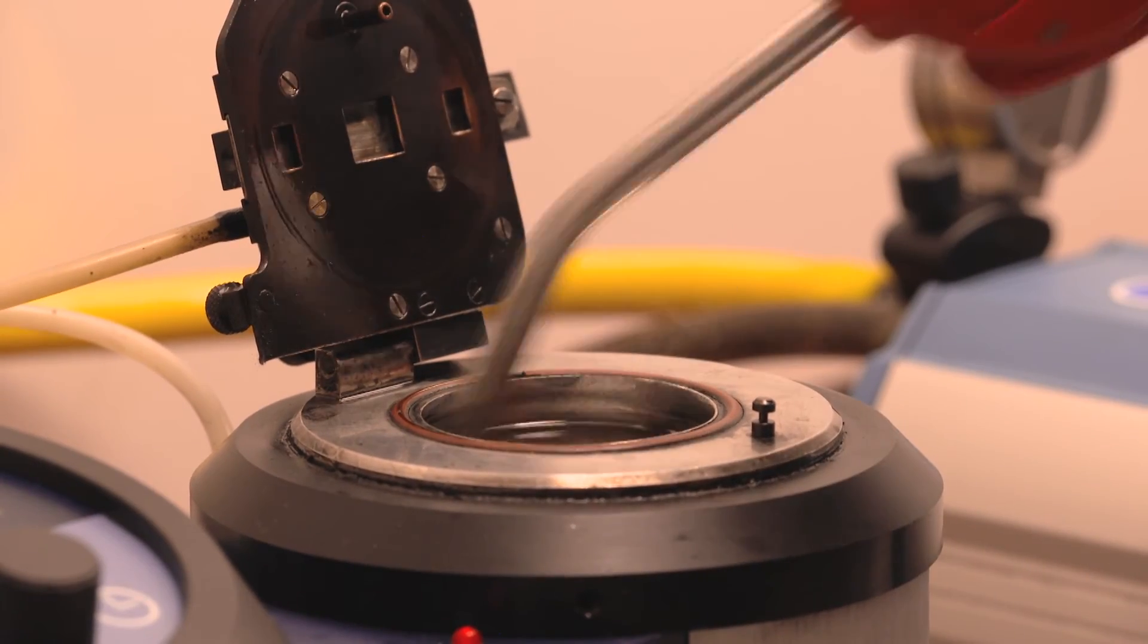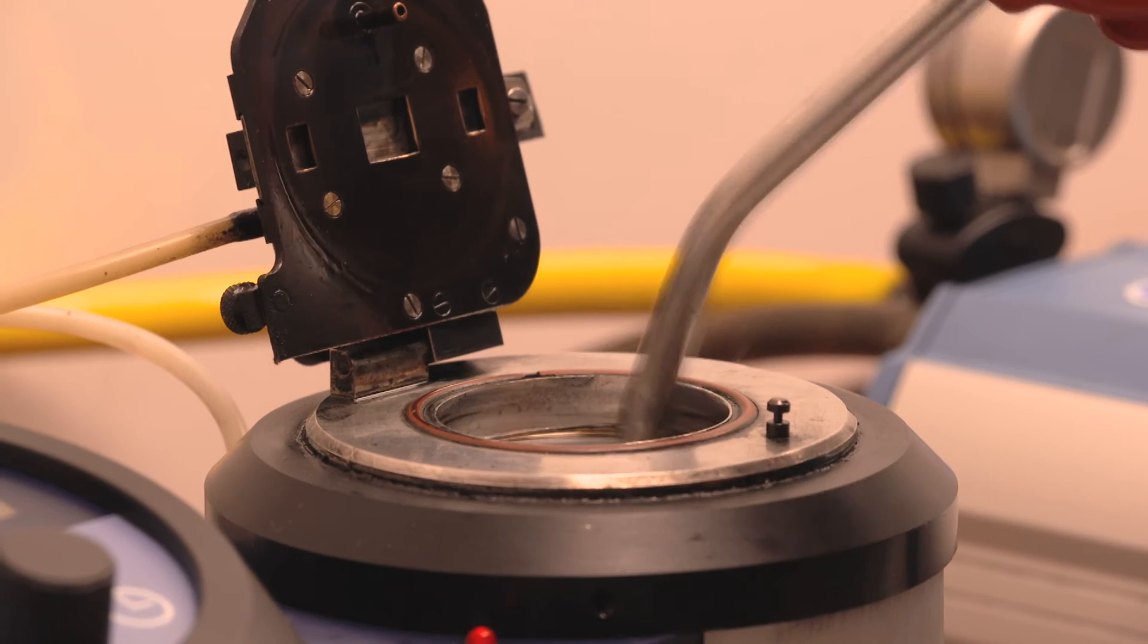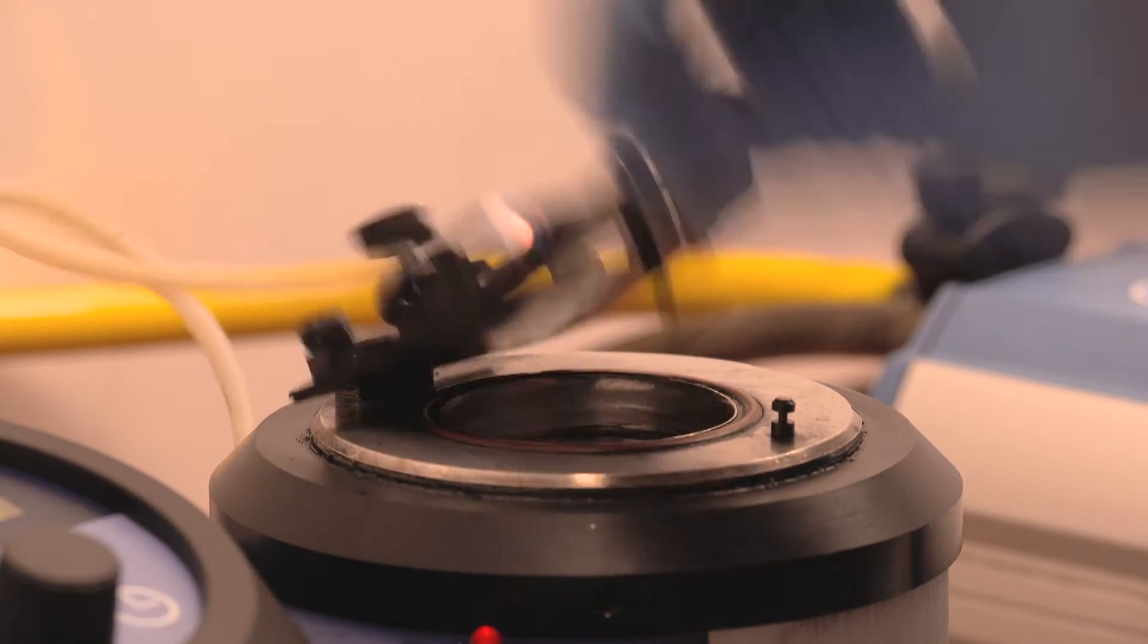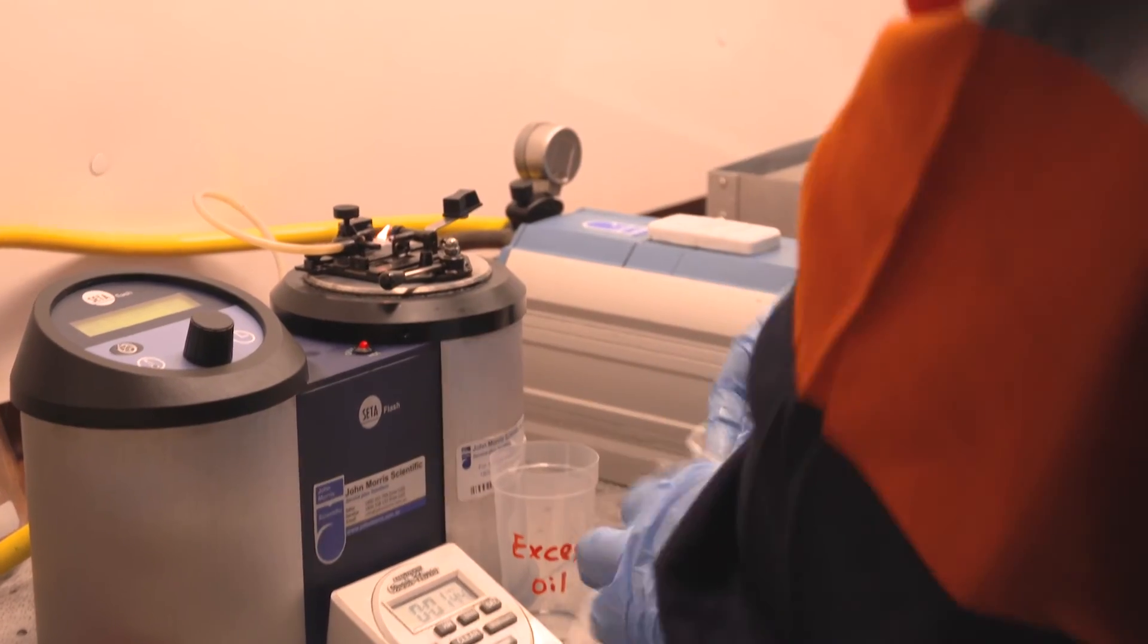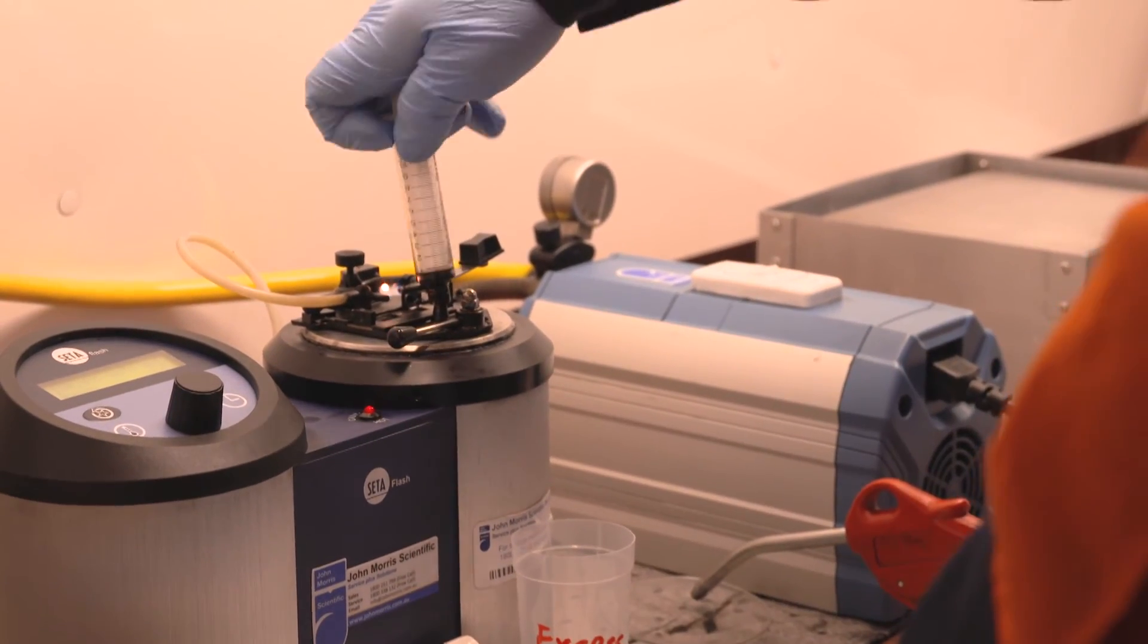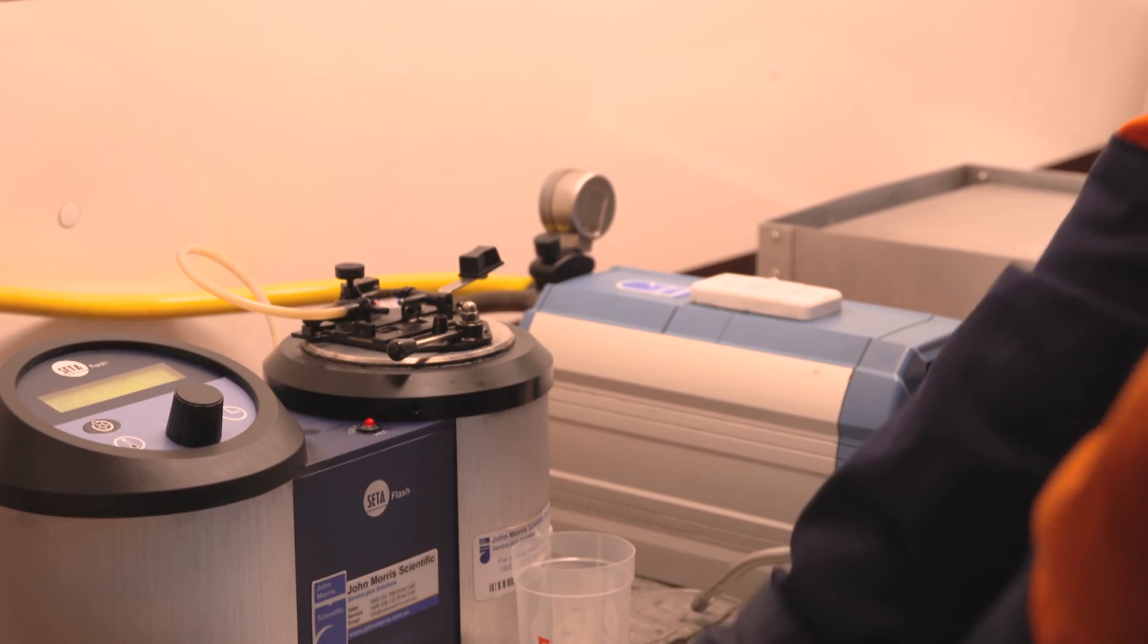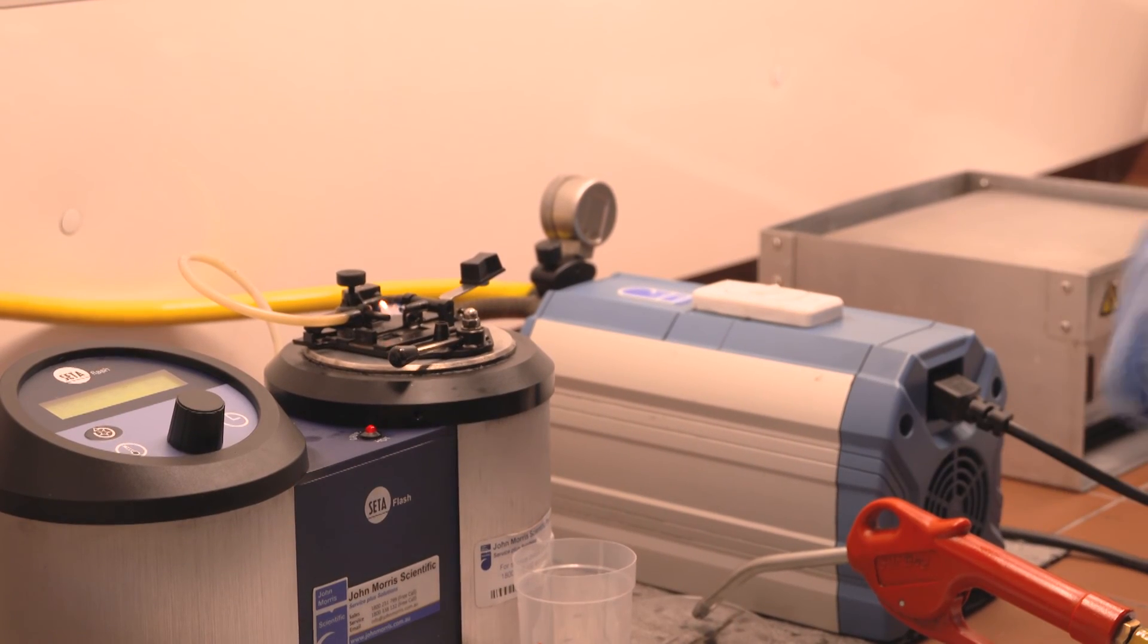Fuel presence in engine oils indicates a fuel rich mixture during combustion, which may be due to faulty fuel injectors or poor operation of equipment. Fuel presence lowers the viscosity of oils which will lead to increased wear on machine components.